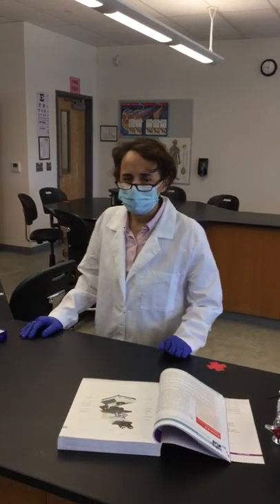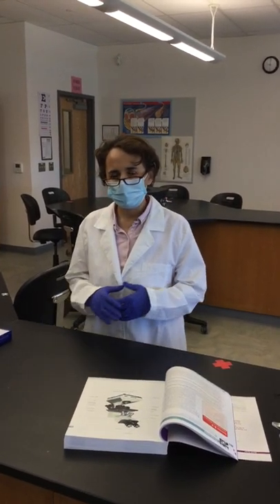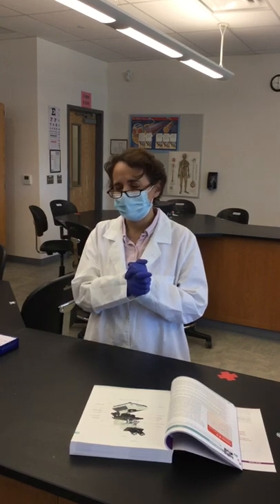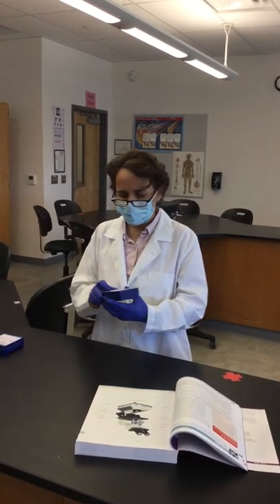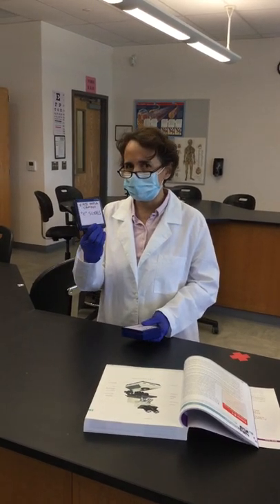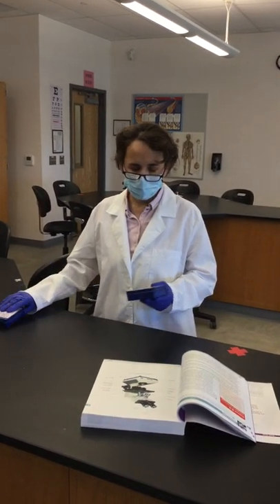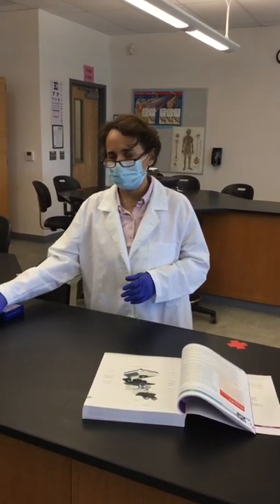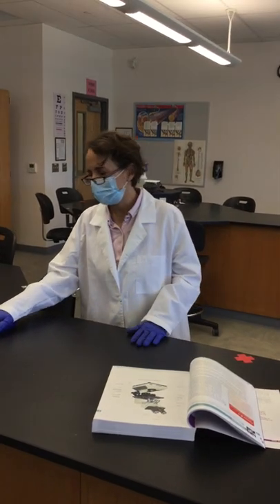Today we're going to use the microscope. I'm going to show you how to focus a slide in the microscope, how to observe a slide, and try to find different depths within that slide. For the focusing exercise, we have the E-slides, and then we'll be using the color thread slides for finding the depth of a sample in the microscope.